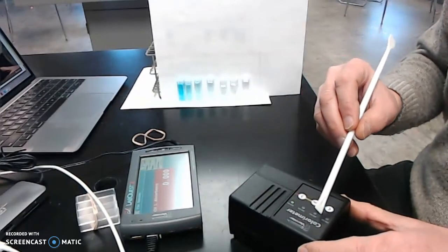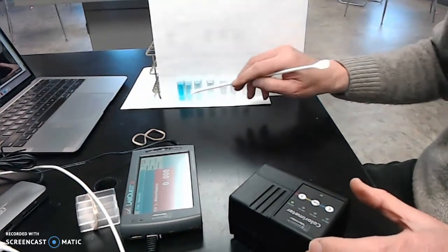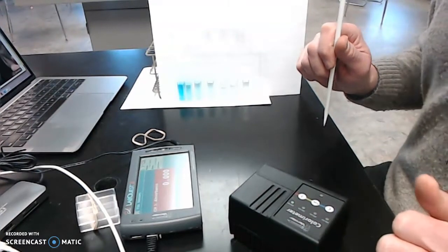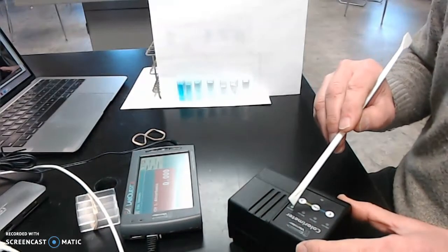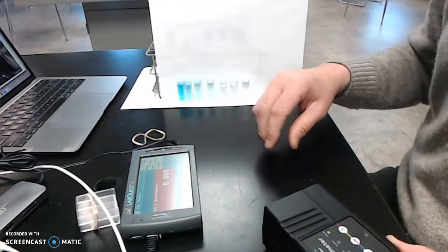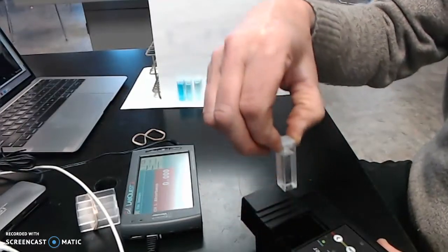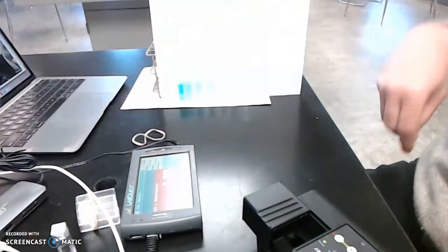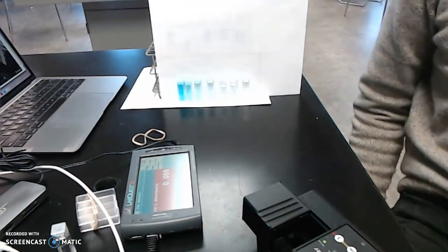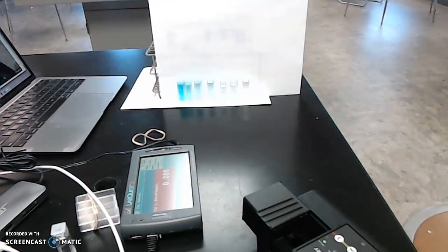The other thing I want to point out is that on the colorimeter, there are 4 settings that one could use, and they're indicated right here. It's different colors of light. And because we've got a blue solution here, we want to use a color of light that is absorbed by the blue solution. So we're using red, on the 635 nanometer wavelength. So let's take our first sample and get some data. Before I do that, I do need to write these down. I've got to go back to a different lab bench and grab my pencil.